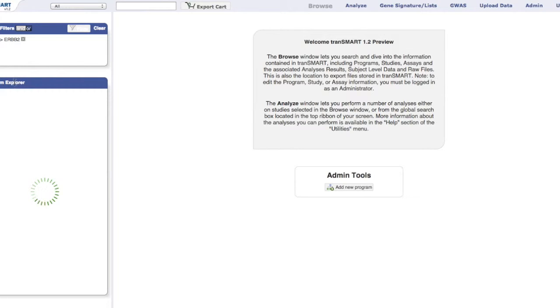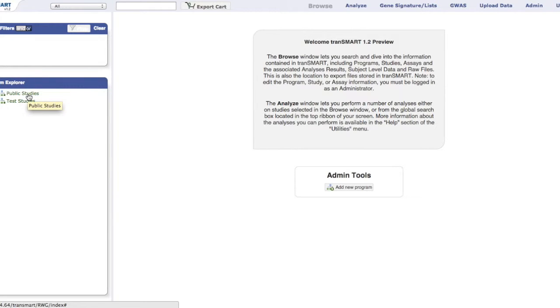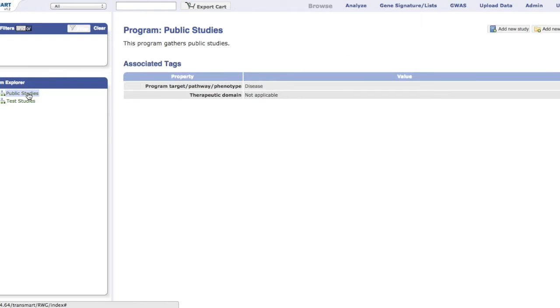The program explorer displays the studies on the site. The types of objects in the explorer tree include programs, studies, analyses, assays, and folders.